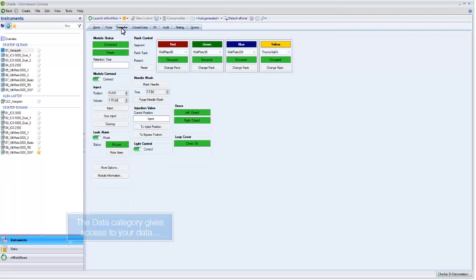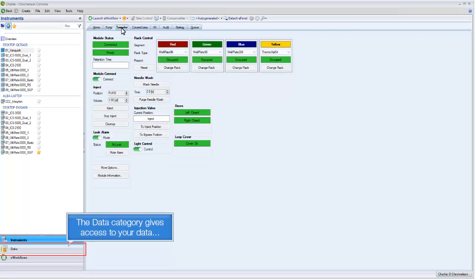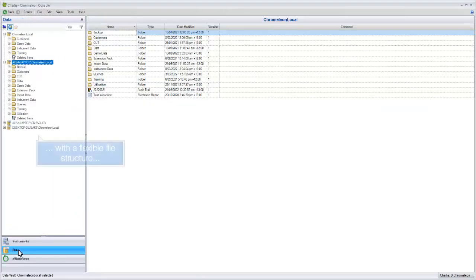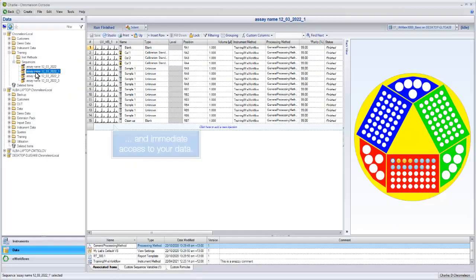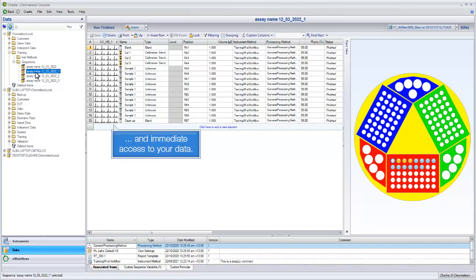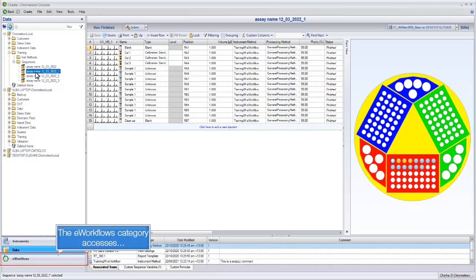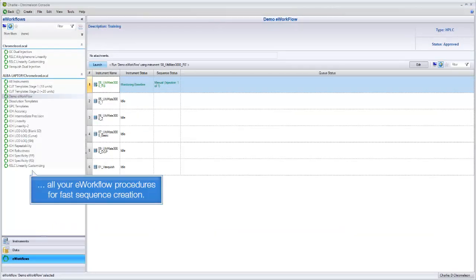The Data category gives access to your data with a flexible file structure. The e-workflows category accesses all your e-workflow procedures for fast sequence creation.